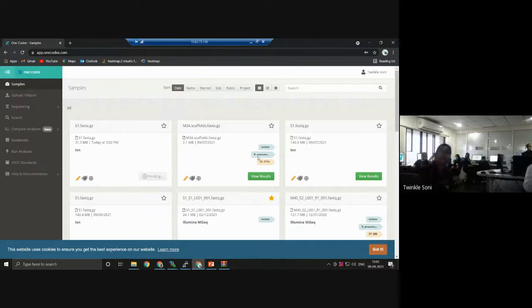As you can see over here, it's a sample from Klebsiella pneumoniae. So there is a tag there, Klebsiella pneumoniae. So the sample belongs to the bacteria Klebsiella pneumoniae. It's the most abundant bacteria. It's some other analysis which I had done. For a metagenomic sample, you will not be having any kind of tag. This icon over here shows what kind of platform you have used. Like over here, you can see Illumina MiSeq because it's Illumina data. So it will be completing.